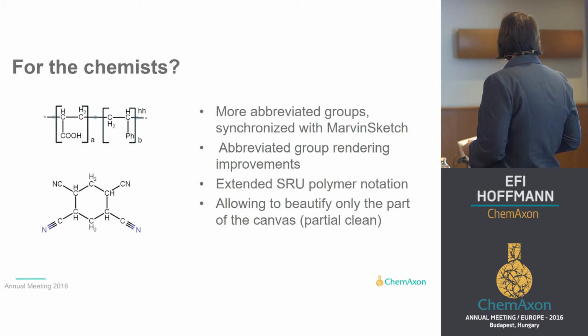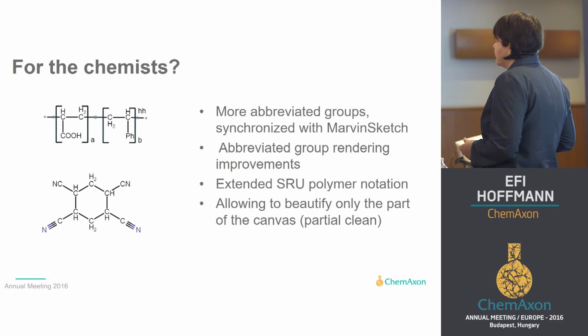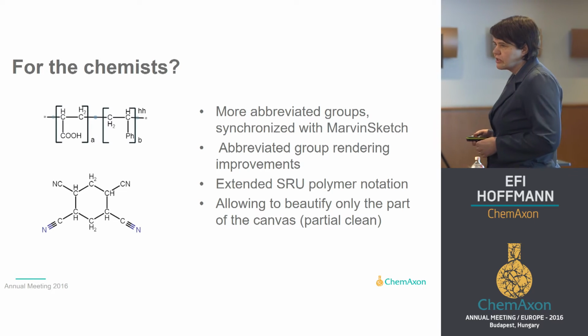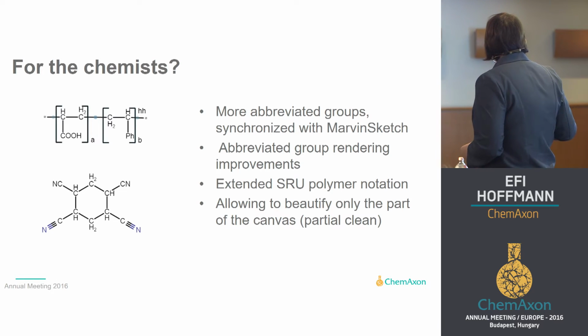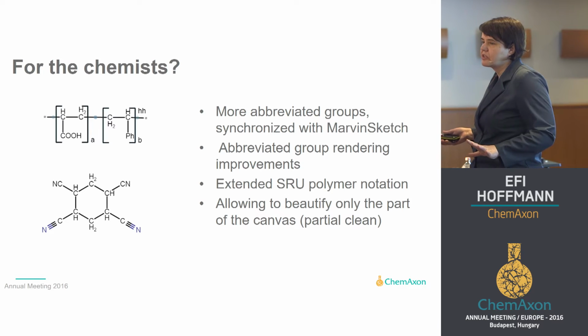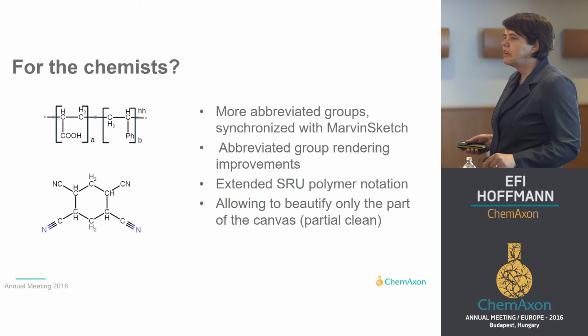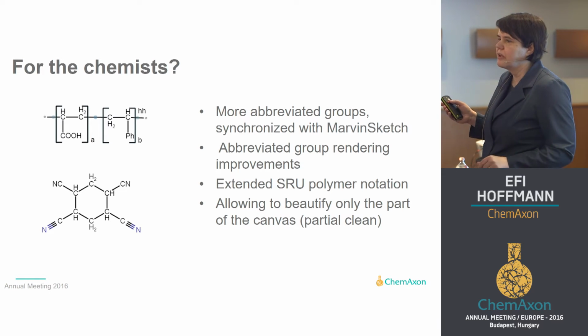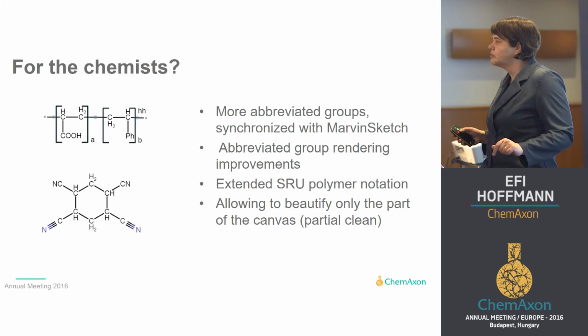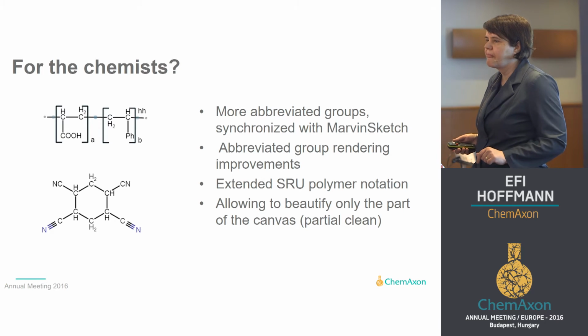Based on your feedback that there is a need, we extended our polymer notations. And there are also some beautifying functions on the canvas. If you haven't seen this, or our new fun game called Aurora Challenge, please come to our demo station.